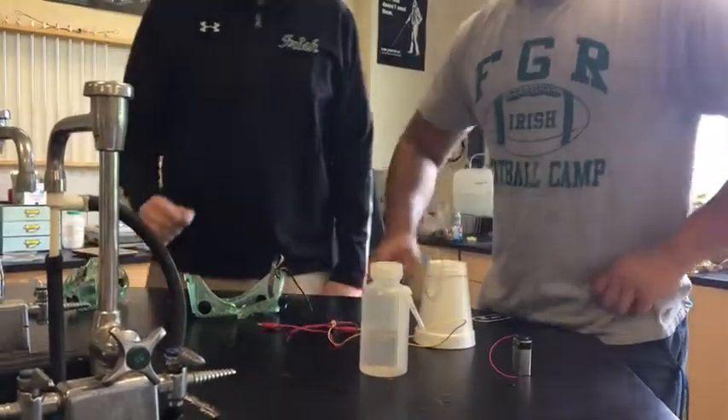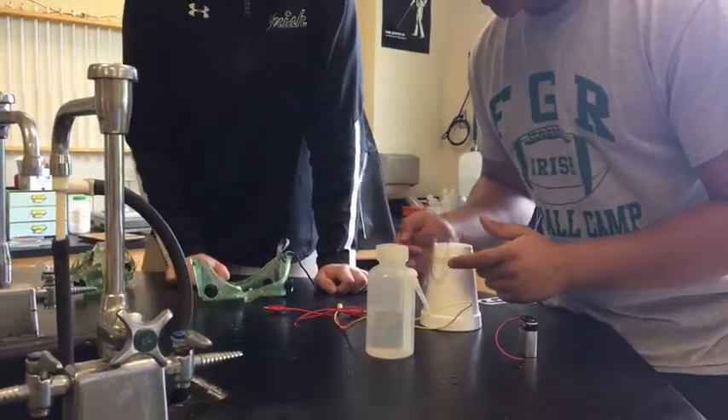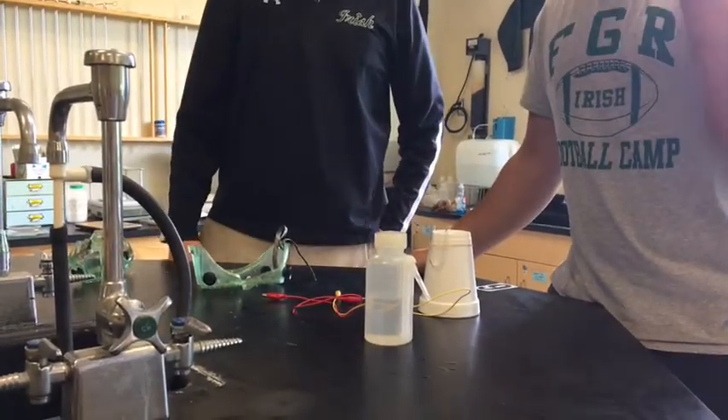So you'll observe the reaction — you'll see a color change in the water right there in your U-tube. One side will be one color, the other side will be the other color, based on which side is the cathode and which side is the anode.